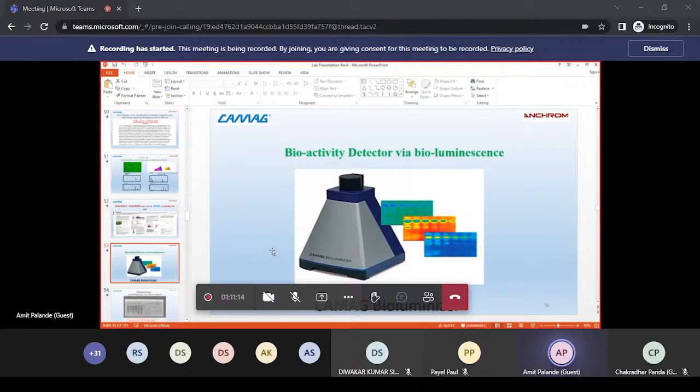According to the ICH Q2(R1) guideline, these are the HPTLC method validation parameters that we follow: specificity, then precision, intraday and interday, accuracy like recovery, linearity, LOD and LOQ (limit of detection, limit of quantification), and ruggedness.